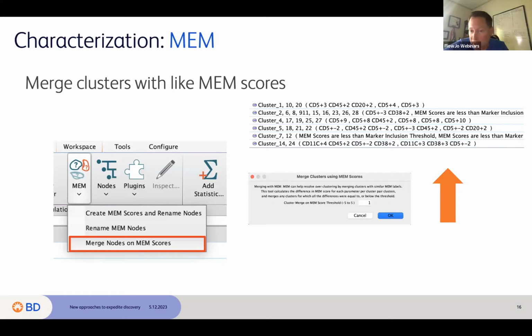It does it as Booleans, so it always keeps the original clusters. If you choose to not use the merge, fine, you've still got the originals, you'll never lose anything. But then you've got a Boolean that combines them, and you get a little annotation that says cluster not merged for anything that wasn't merged at all. So if you want to create another overlay or graphic that shows all the ones that are in your final output, including merging, it's easy to figure out what's what.